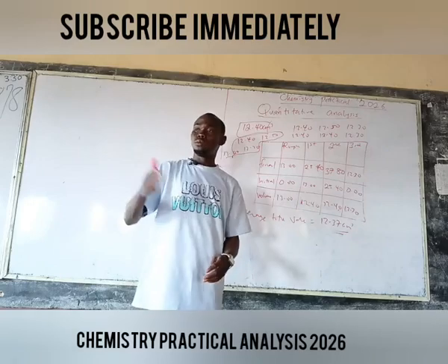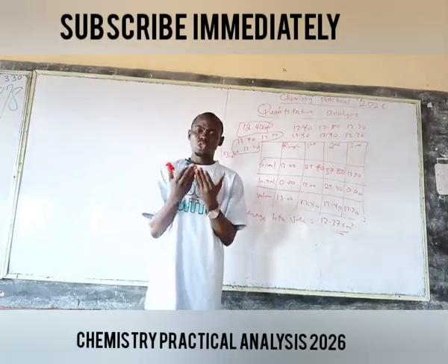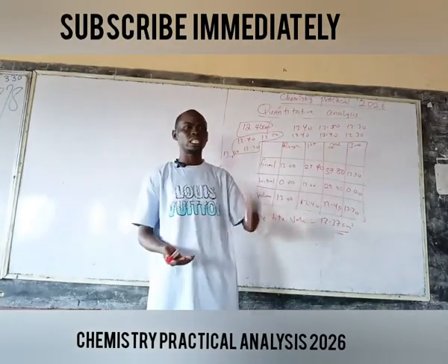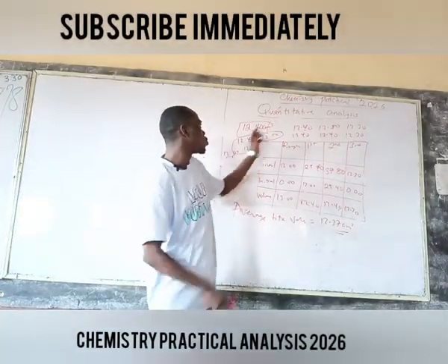Make sure you check for precision, that all of you in that lab are getting very close values, even if it is not as accurate as your teacher's. That is it on quantitative analysis.